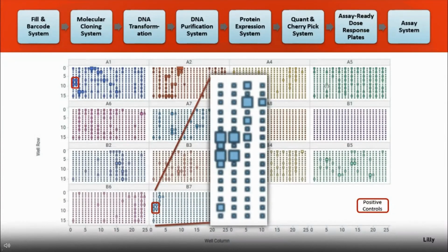And this is a 384 ELISA plate, and let me zoom in here on one of these. You can see a nice titration of some positive controls. There are controls in the first column, and there are 2 fairly strong positive controls, and you see a nice titration.